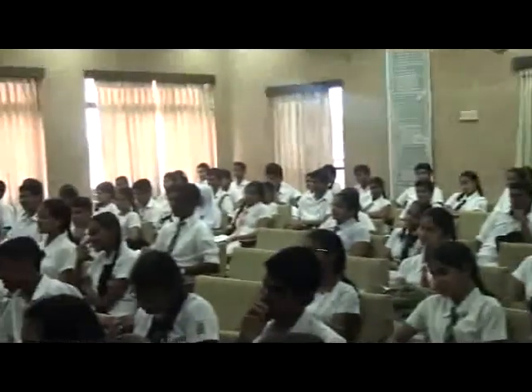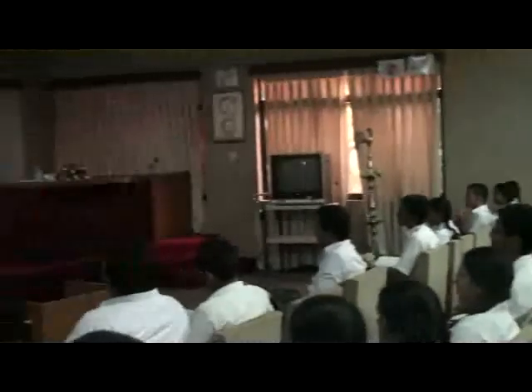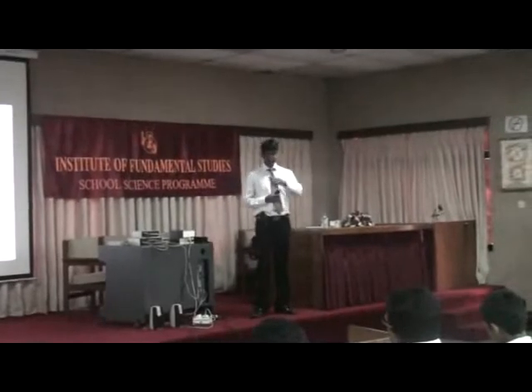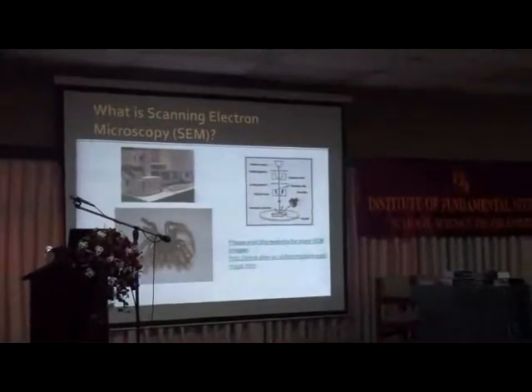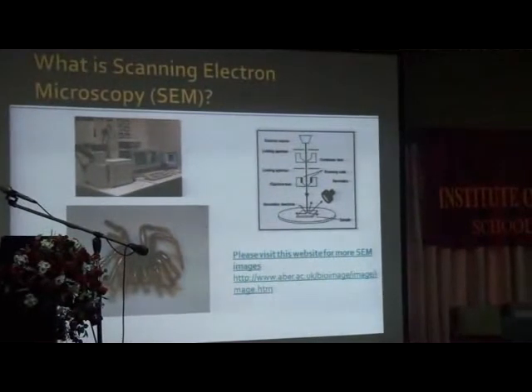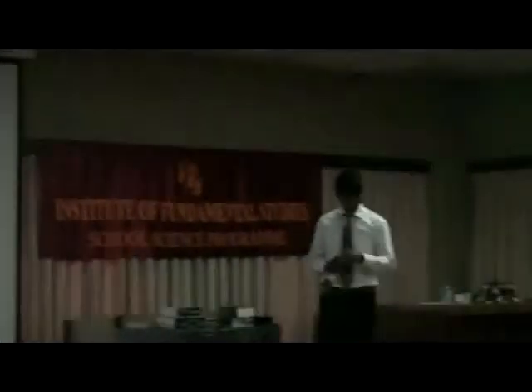Scanning electron microscopy is an alternative to the light beam. So far, to view microstructures, we have been using optical microscopes. An optical microscope is a device used to see tiny things, like cells and atoms, using a light beam. Because of physical phenomena like diffraction, which are relevant to the wavelength of the light we use, we cannot go beyond a certain limit.